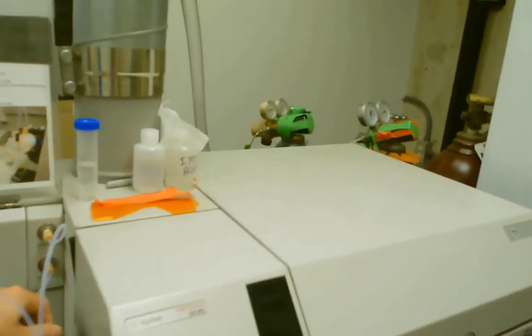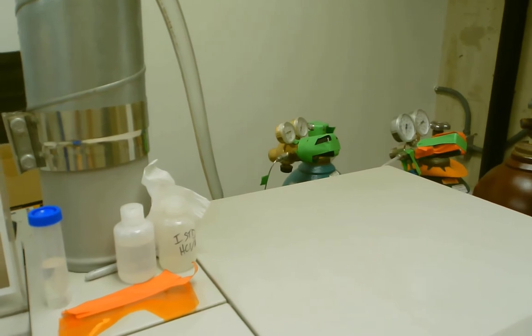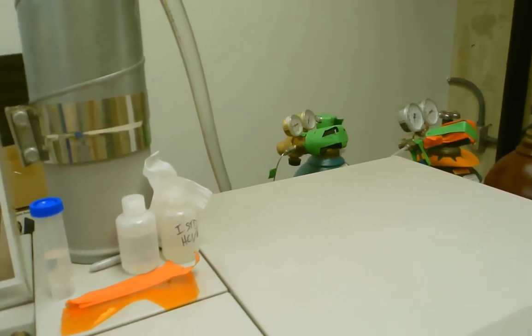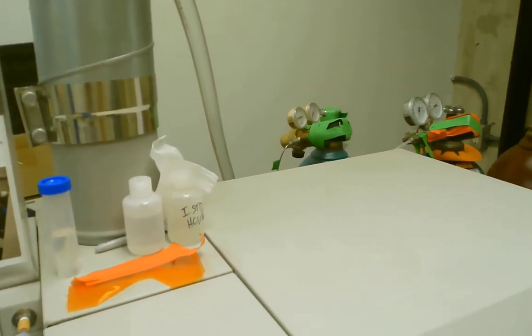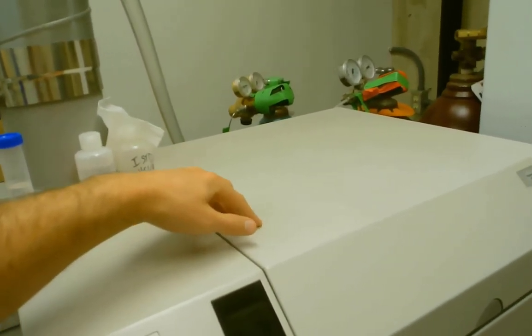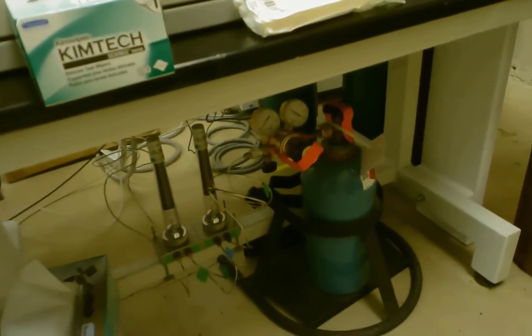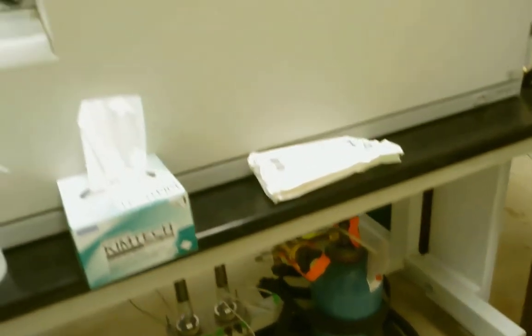We also have a couple different gases in the back. So we have a helium tank that is specifically for the laser ablation system. So that's the carrier gas there. And then we have another helium tank that is the octopole reaction gas, as well as another optional octopole reaction gas of a hydrogen tank down below.